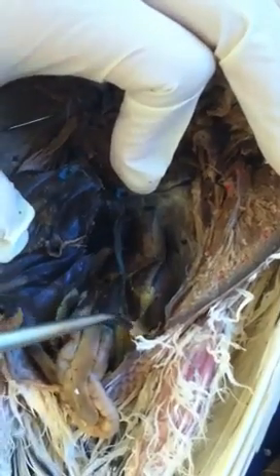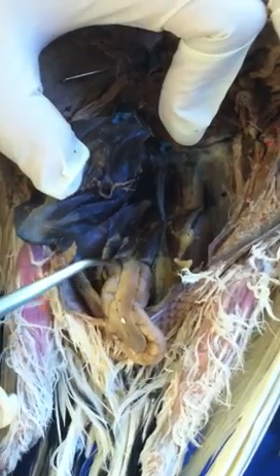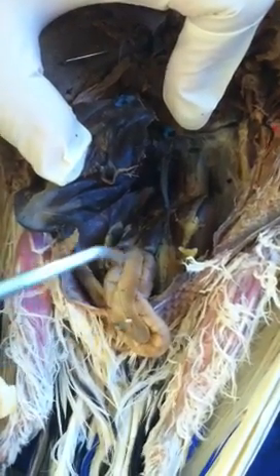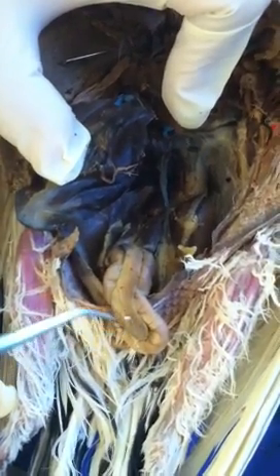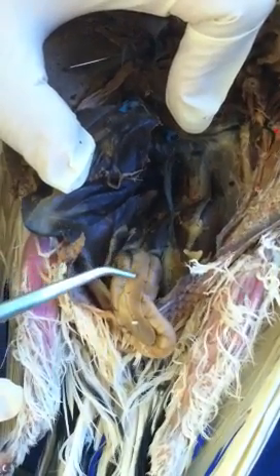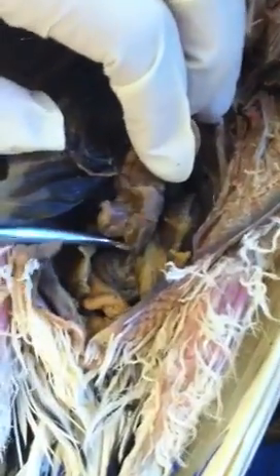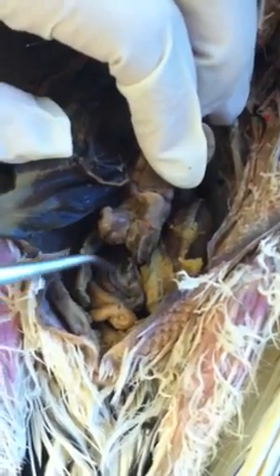Going along the gizzard, you will see it's attached to the intestine. On top of the intestine there's an organ — that's actually the spleen, the bird's spleen, very obvious on top of a loop of intestine. If I flip the intestine, you will see on the bottom that's the pancreas.